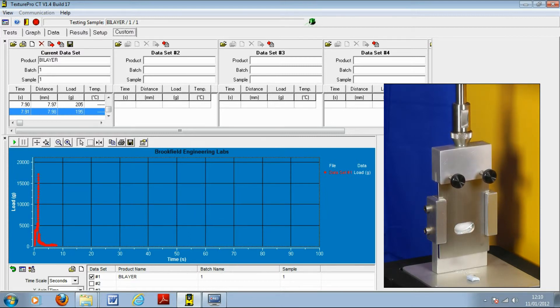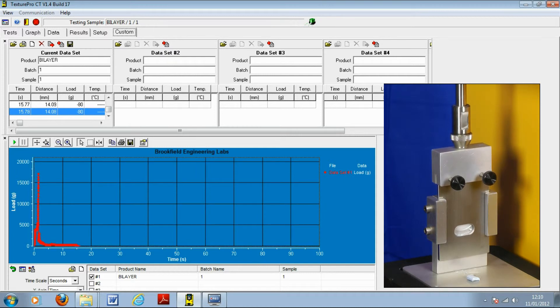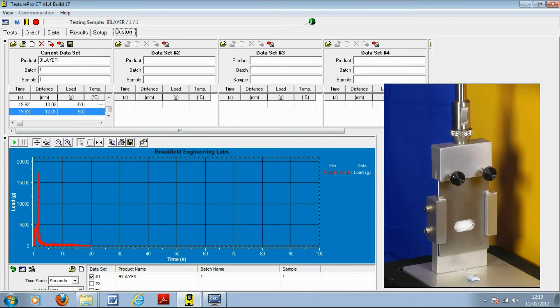The peak value on the graph is the force required to separate the compacted layers of the tablet. Once the target distance has been reached, the blade returns to its starting position.